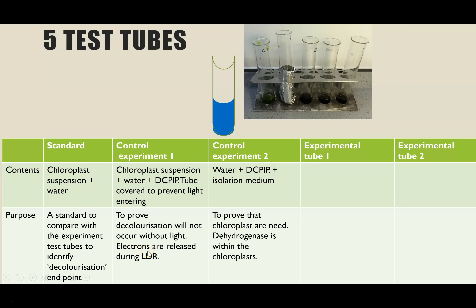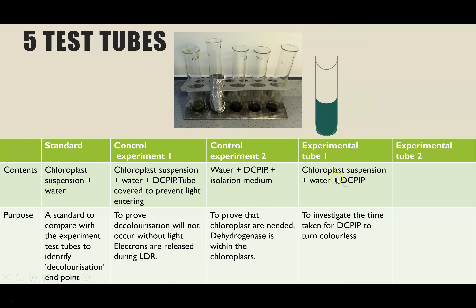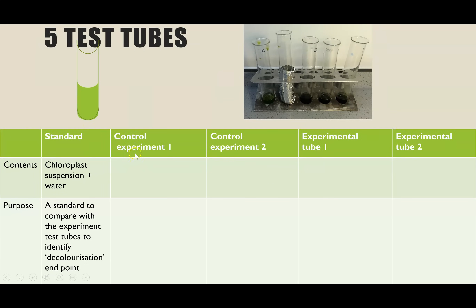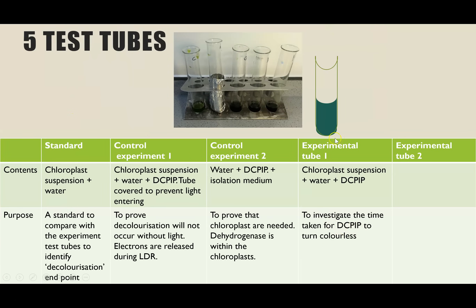The actual experimental tube one contains chloroplast suspension, distilled water, and DCPIP. Because the DCPIP is bright blue mixed with the chloroplast suspension, it appears as a teal color. I'm going to time how long it takes for this tube to turn completely green, matching the standard tube C — that will indicate when the DCPIP has turned colorless and the endpoint of the reaction has been reached.